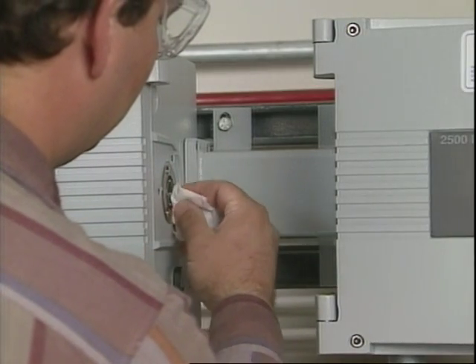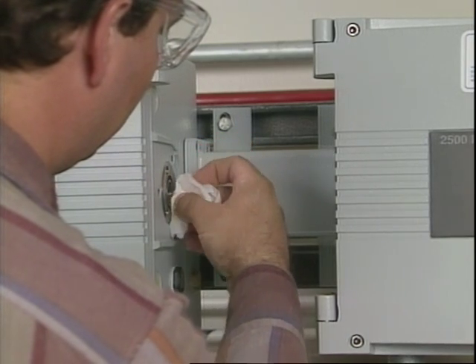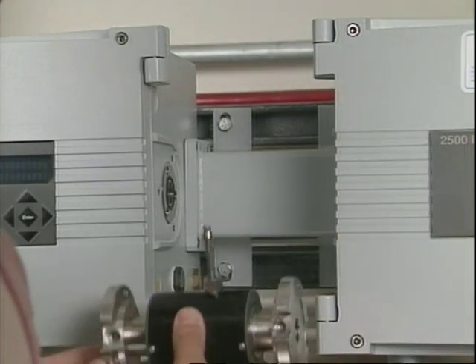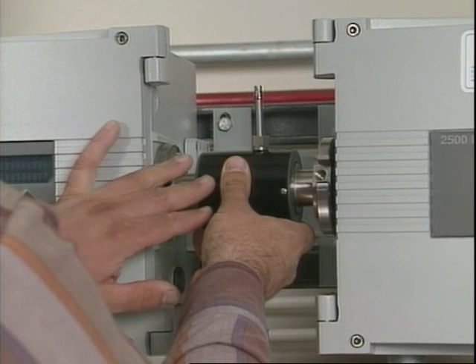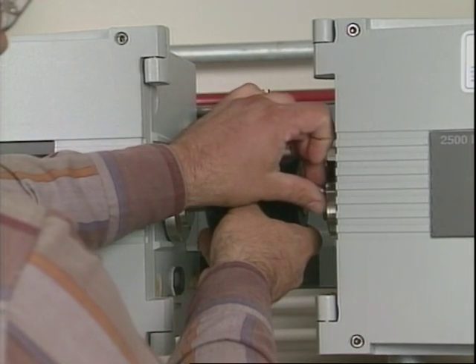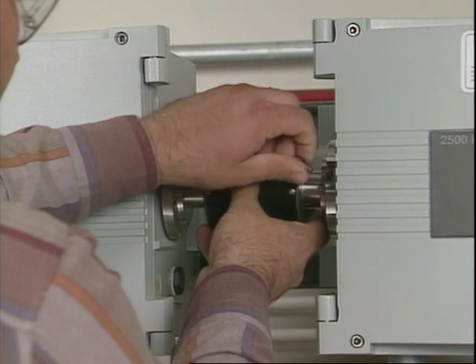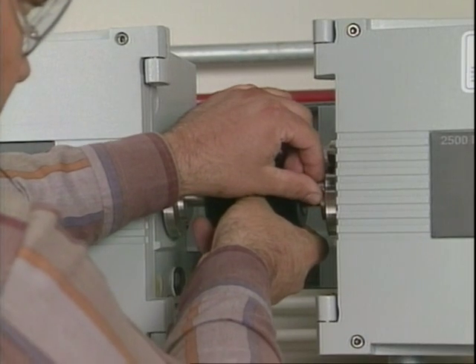Reinstallation is the reverse of the dismantling process. Be sure mating surfaces are clean and install new dry O-rings. Place the cell assembly into the analyzer chassis and install one screw on either side to support the cell. Spread the flanges to seat properly and install the remaining mounting hardware. Be sure to fully tighten the screws holding the source end onto the mounting chassis.